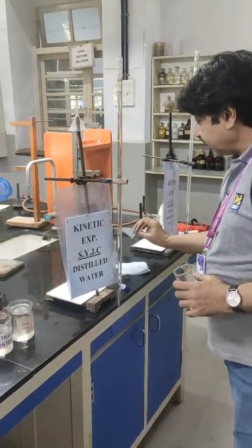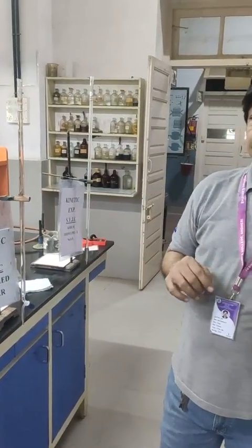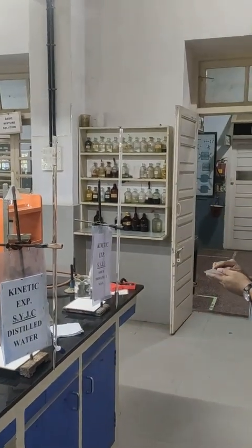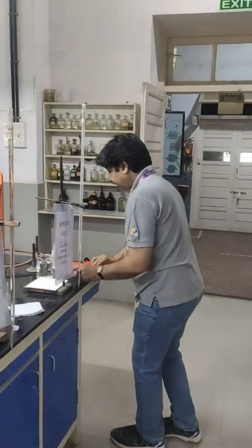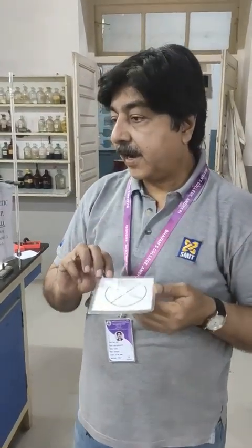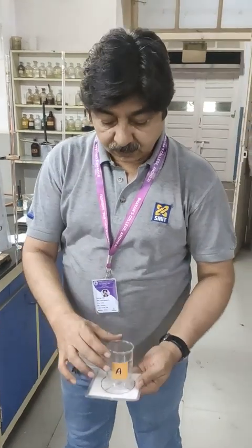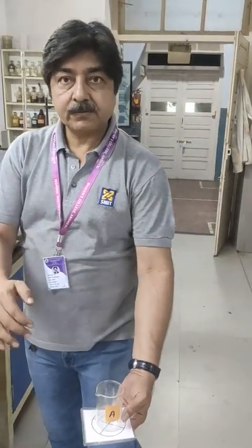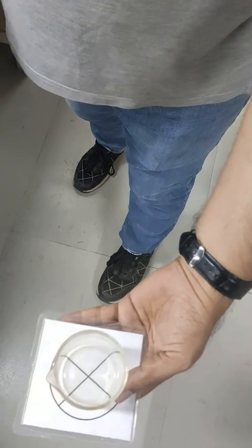But before starting with this, what should I do? Let me take a paper, and on this paper let me mark with the help of a pencil a cross mark like this, and I shall place this container like this, and I have to observe this container from the top. This cross mark is visible.